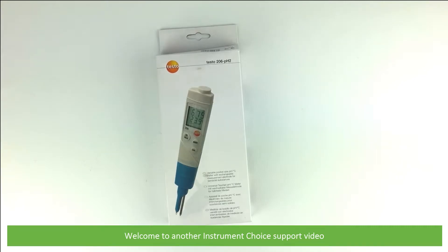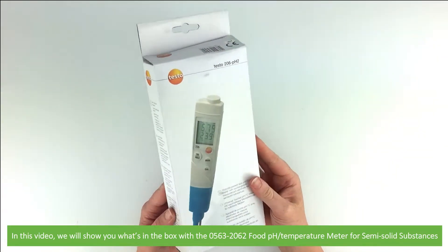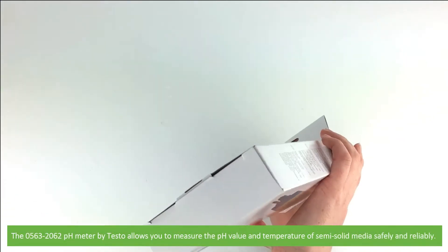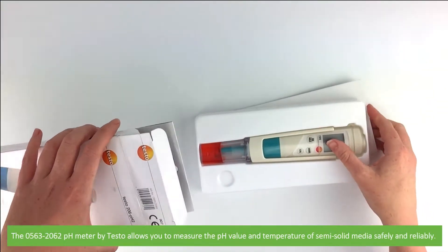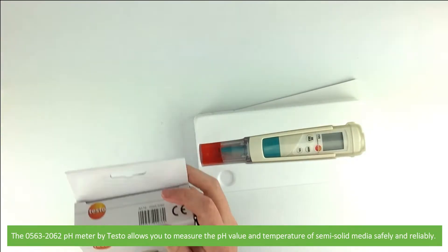Hi and welcome to another Instrument Choice support video. In this video we'll show you what's in the box with the 0563 2062 food pH temperature meter for semi-solid substances. The 0563 2062 pH meter by Testo allows you to measure the pH value and temperature of semi-solid media safely and reliably.